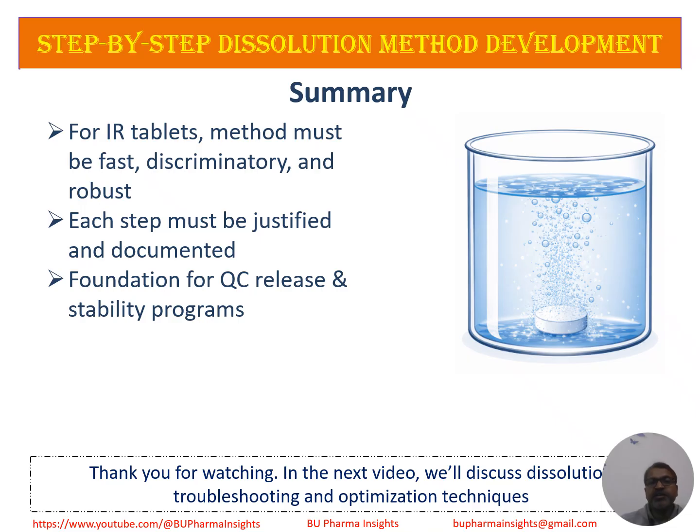To summarize, for immediate release tablets, the dissolution method must be fast, discriminatory, and robust. Every step must be scientifically justified and properly documented. This method then becomes the foundation for QC release testing and stability programs.